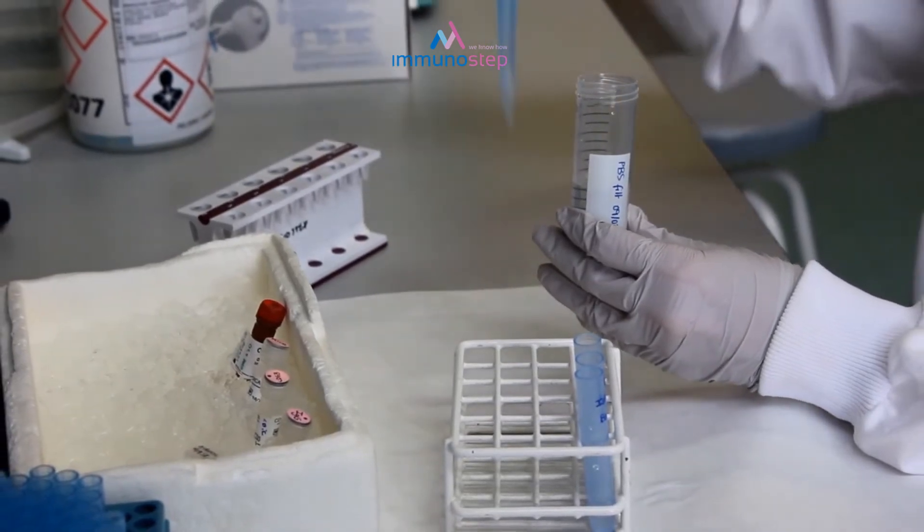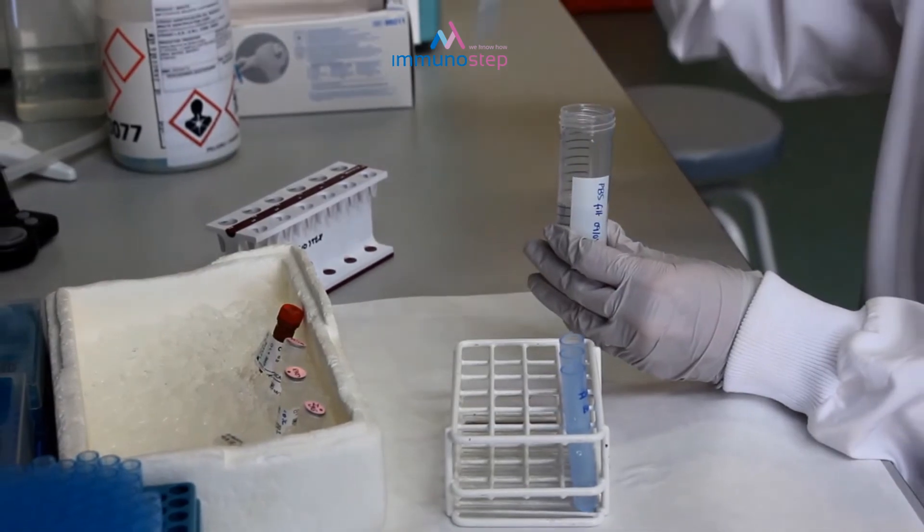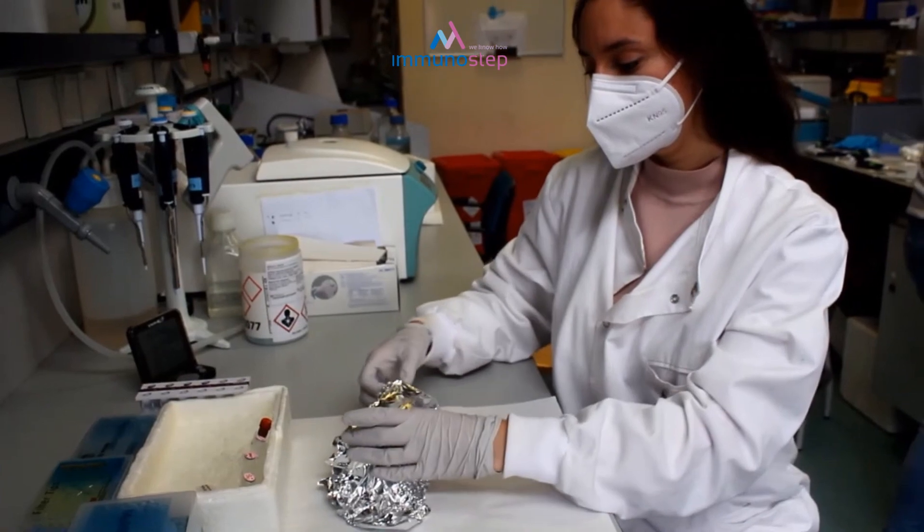Finally, we wash again with PBS, and we are now ready to analyze the beads at the flow cytometer.